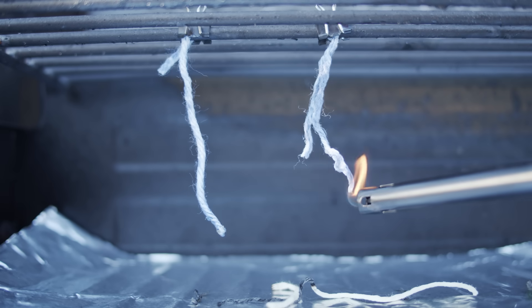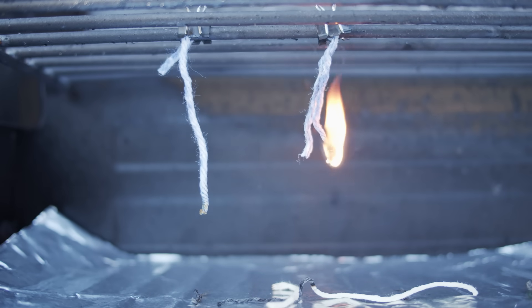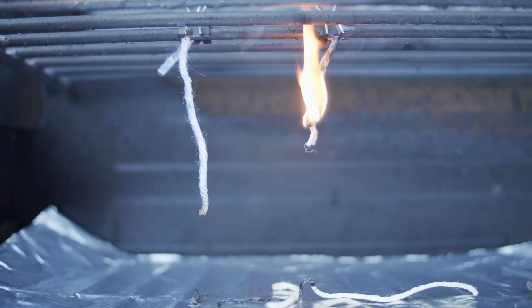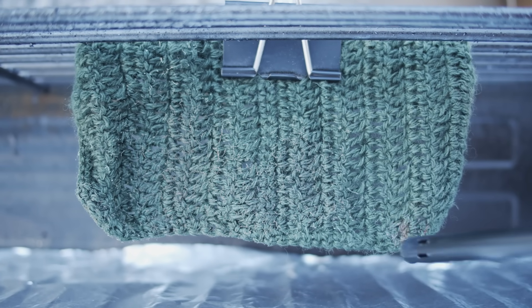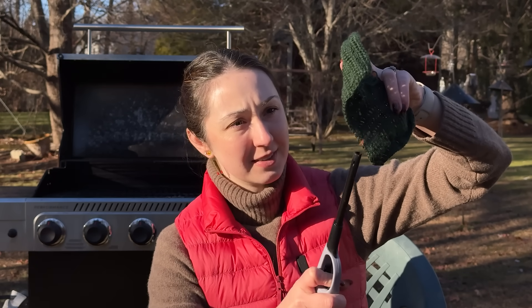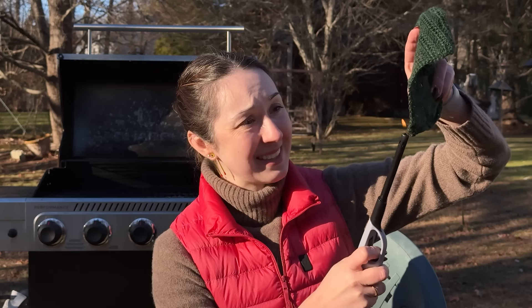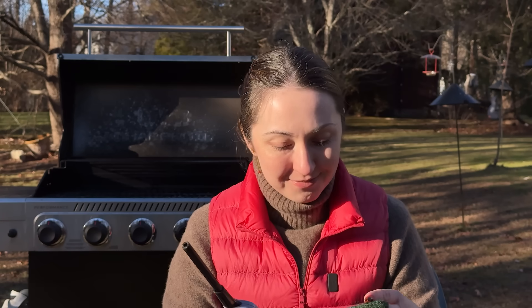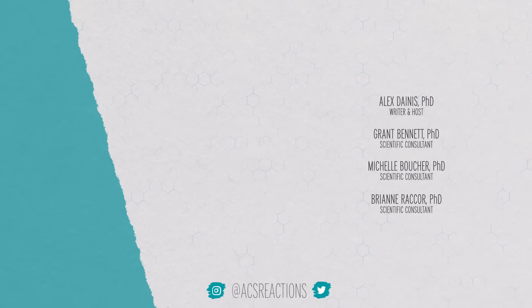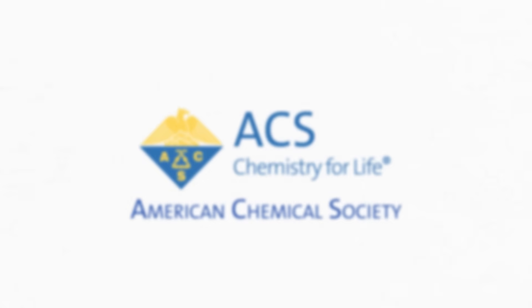So I replicated the paper — but what else can I do with this? I thought about making a flame retardant paint, but clothing would be pretty tough — it would be stiff and not very washable. So I crocheted some of the wool yarn into a pot holder — what about a flame resistant pot holder? It's not lighting on fire, but again, this is not super practical. The way I think this would be most useful is as an inner layer in fireproof gear or outdoor wear, but it's not great on its own. What should I try and fireproof? Give me some ideas, YouTube — let me light some things on fire.